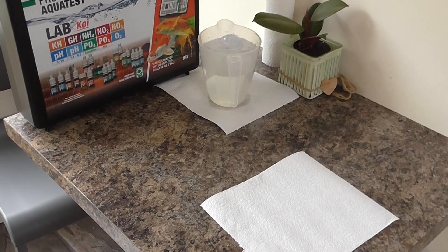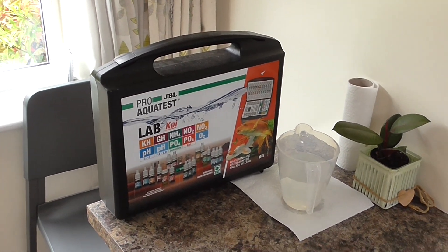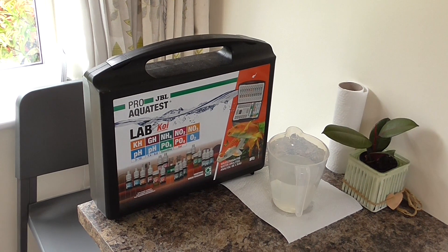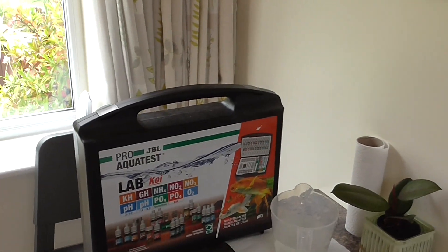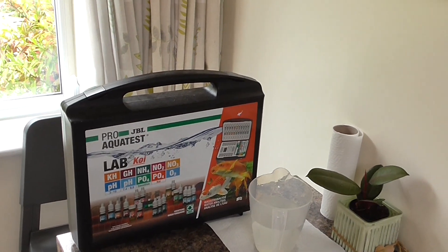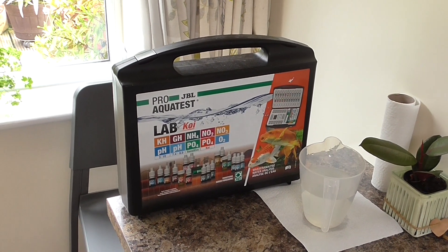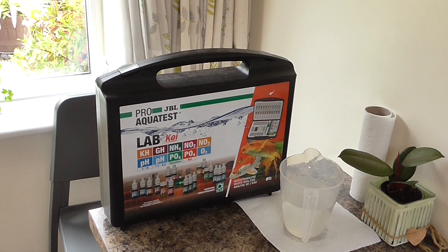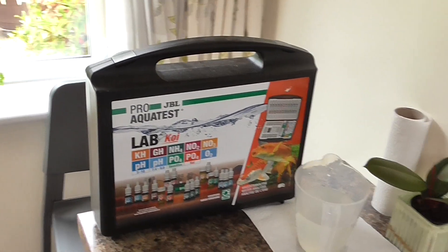Hi, this is my first video and I'm just going to give you an idea of the tests I use on the water — my pond water. I've got various test kits, but as I'm sure a few of you know, the colors are sometimes difficult to read exactly. I'm red-green colorblind anyway, so it's pretty difficult.